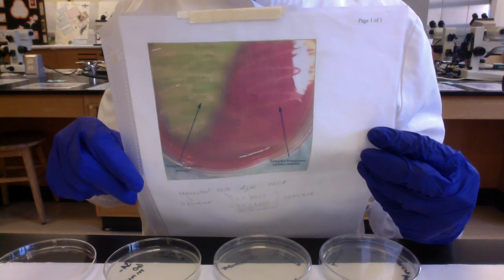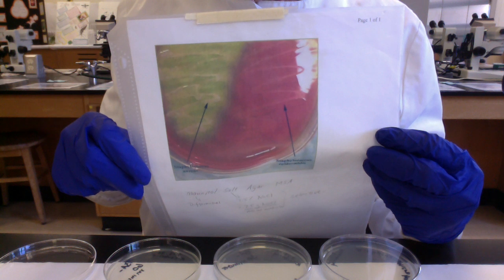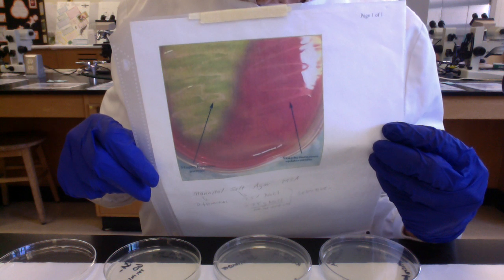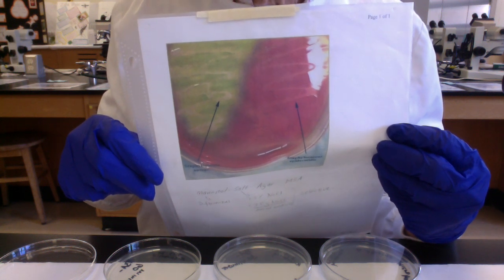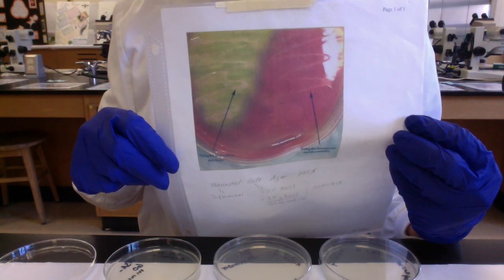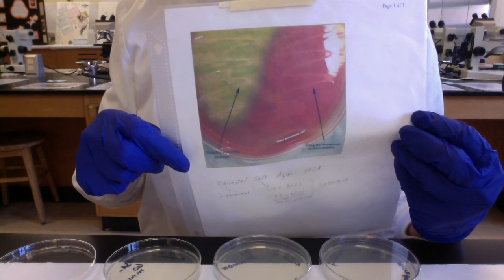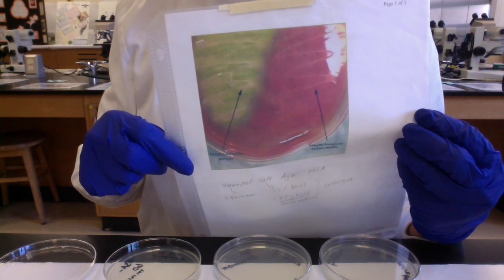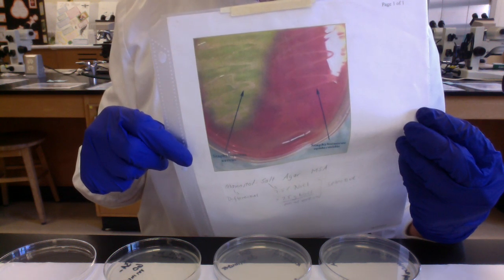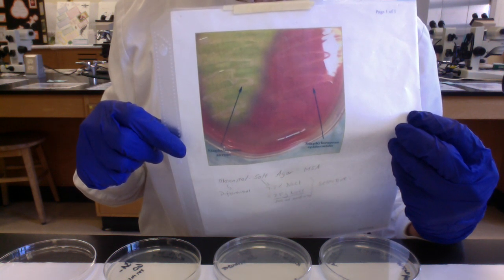With mannitol salt agar, the salt is sodium chloride. Most microbes don't grow well at high sodium chloride concentrations, but members of the genus Staphylococcus have evolved to live on human skin, which is salty from sweat, so they are pretty salt tolerant. To inhibit the non-salt-tolerant microbes, we use a sodium chloride concentration of 7.5% in our mannitol salt. And 7.5% weight per volume means we're going to add 7.5 grams of sodium chloride per 100 mL of medium.